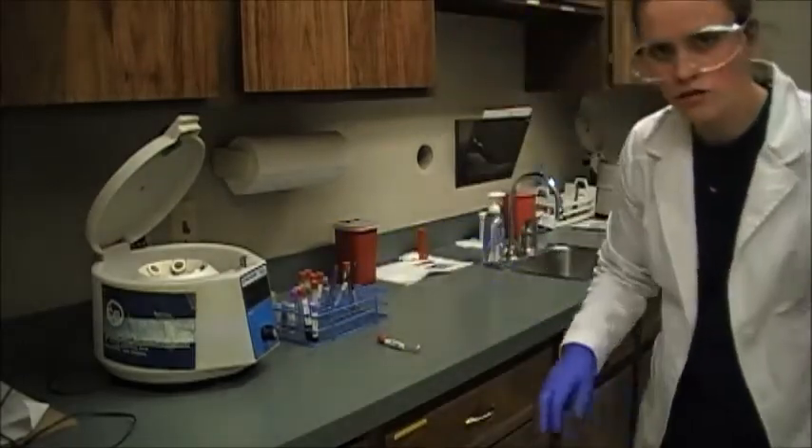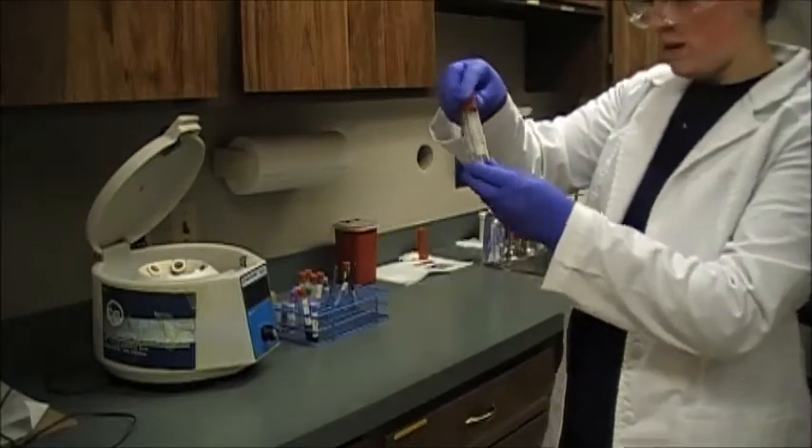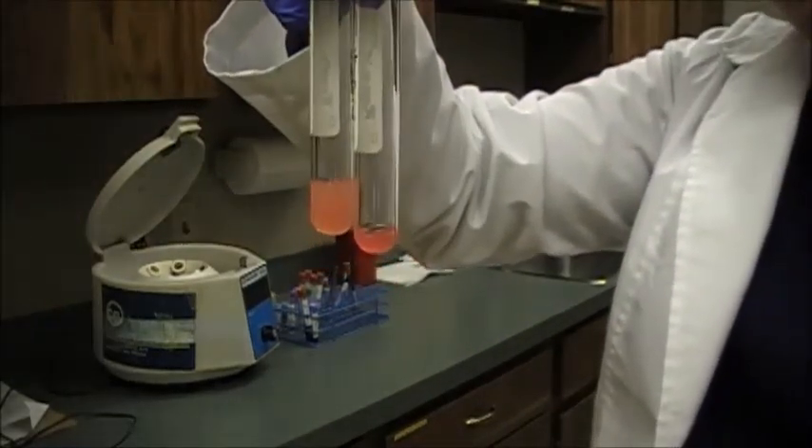Those are our two samples — we've got our serum and our plasma right here, and that was how we harvest those. So we just harvested the serum and plasma off of that blood sample. I'm going to take a moment now to show you hemolysis and lipemia — what we're looking for when we're getting the serum and plasma from a sample.